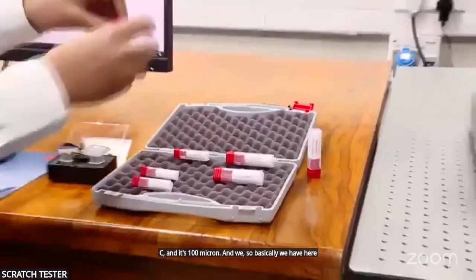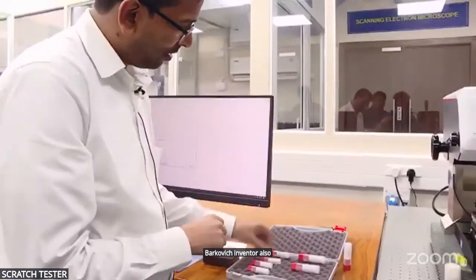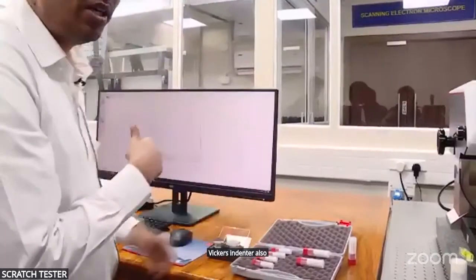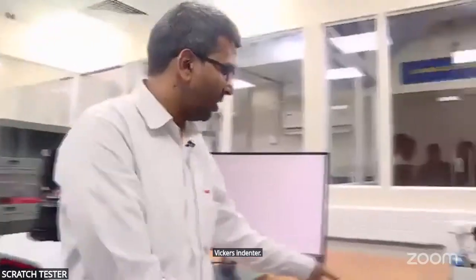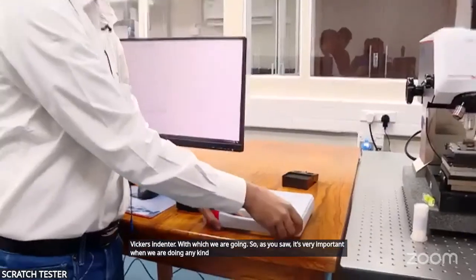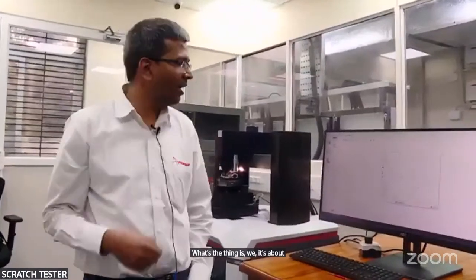Similarly, we have a Berkovich indenter also, if required. Then you have the Vickers indenter also. Currently mounted here is a Vickers indenter, with which we are going. As you saw, it's very important when we are doing any kind of indentation, because indentation is about surface area and height.